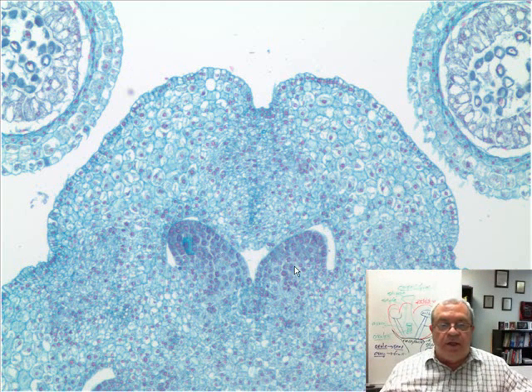And what are these things here? Well, they are baby somethings. Baby whats? They are baby ovules. We'll see more mature ovules later. But these are ovules inside the ovary. Two baby ovules inside kind of the baby ovary as well. And so what will develop into what as this flower develops? Well, ovules develop into what again? Ovules develop into seeds, and the ovary develops into what? The fruit, or at least part of the fruit. And so we'll just say the ovary develops into the fruit.